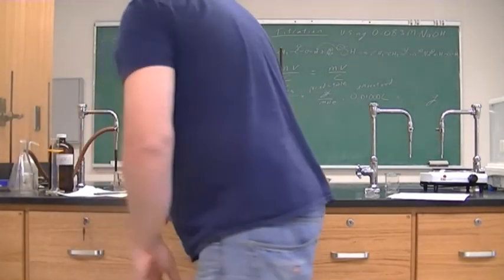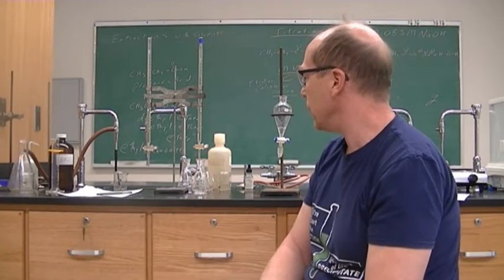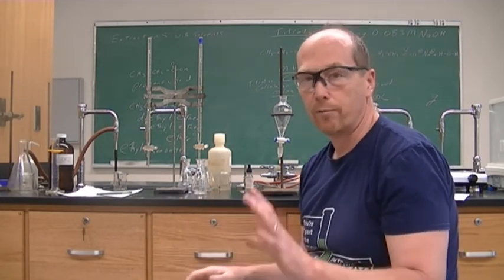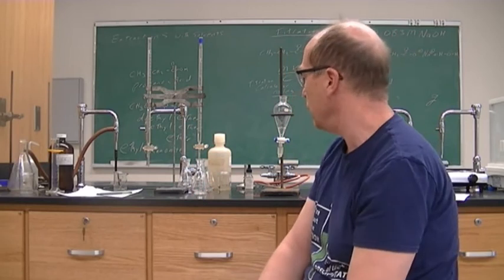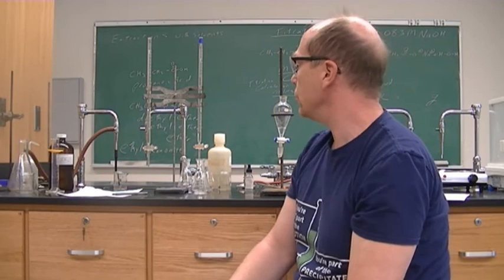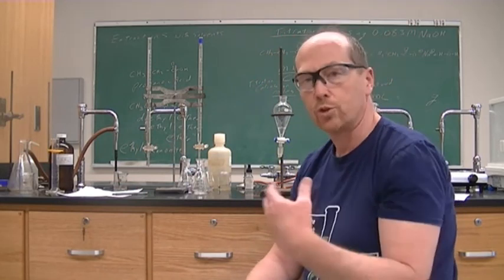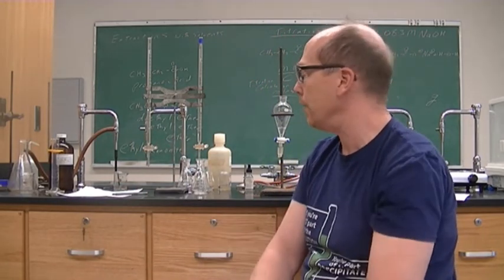All right, so those are the data points that you need to calculate how much was extracted by using 15 mils one time versus how much was extracted by using 15 mils, but 5 mils, then 5 mils, then 5 mils. And so I can see by our numbers, it was definitely better to do it 5, 5, and 5. There would be a lot more extracted with the 5, 5, and 5 than on the 15. All right, that is the end for extractions.